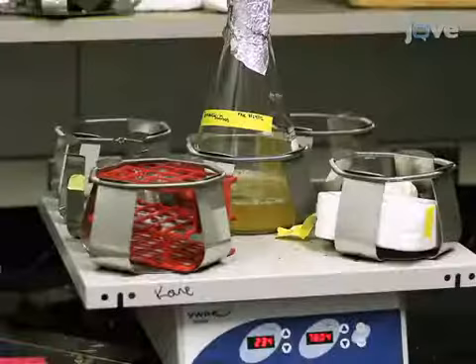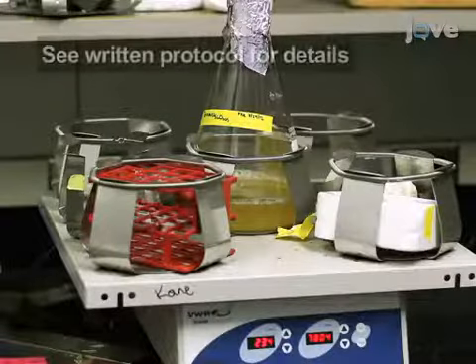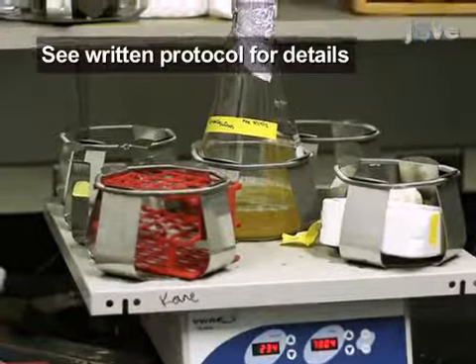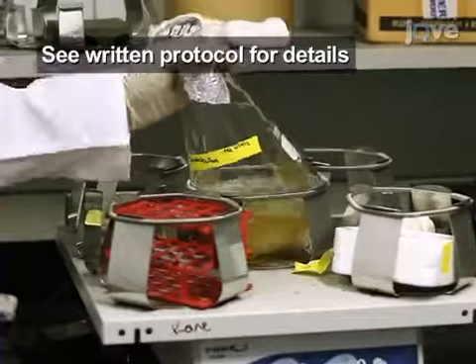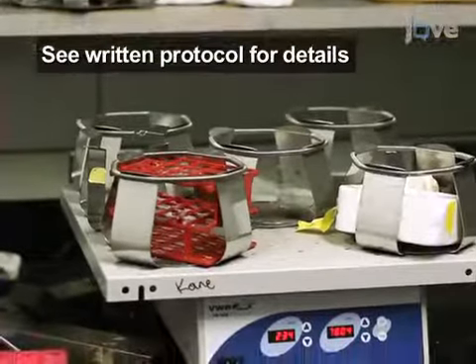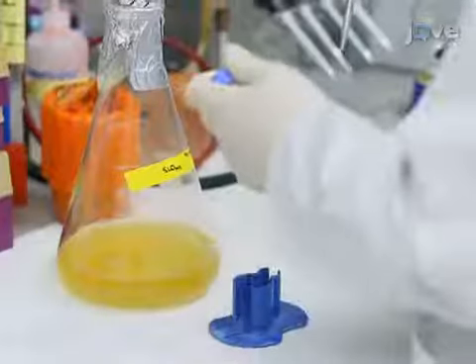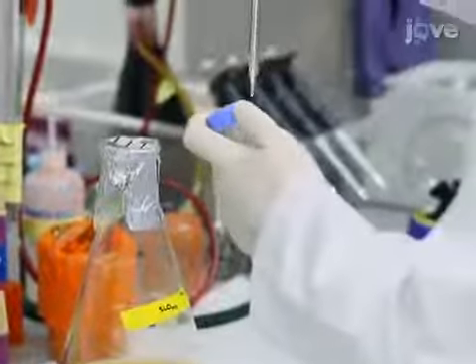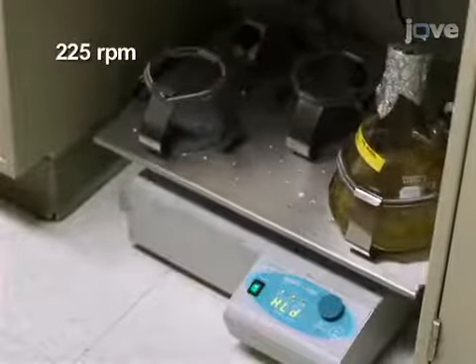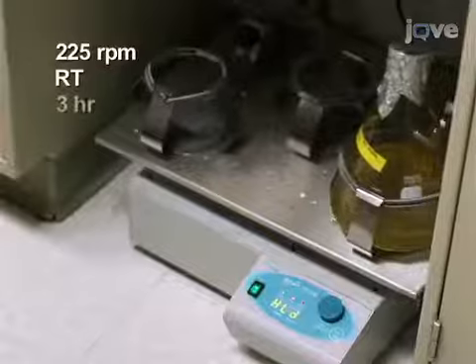Begin the purification of streptolysin O, or SLO, with a culture of BL21 gold cells containing pBAT-G3-SLO-his plasmid grown to an OD of approximately 0.6. To induce protein expression, add 5ml of 20% arabinose to the culture and shake at 225 RPM at room temperature for 3 hours.